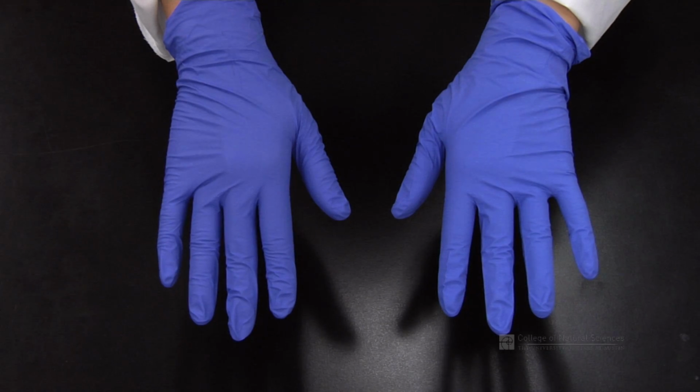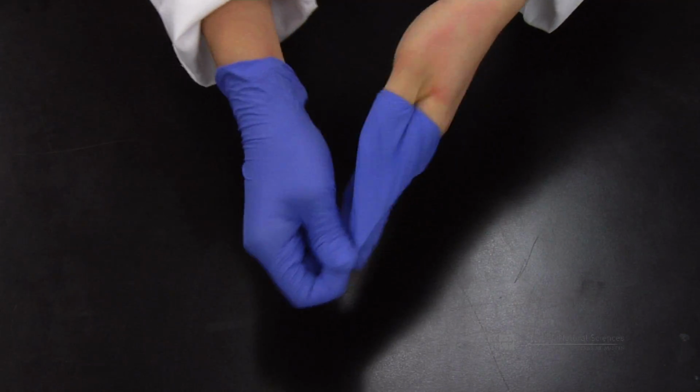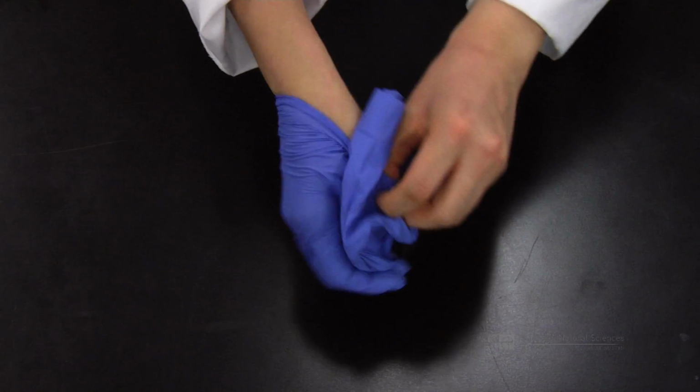We've touched on this a little bit, but we'd like to stress the importance of hygiene in lab. It is important to protect your skin. Skin should be protected by clothing and/or a lab coat, and closed-toed shoes should be worn to protect your feet. You should not wear shorts, tank tops, or open-toed shoes in the lab. There have been a number of injuries to students who did not follow this rule. If you think your gloves have become contaminated, remove them. Wash your hands and put on a new pair of gloves. Wash your hands frequently, especially before leaving the lab.